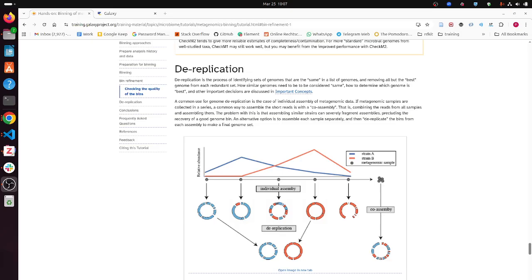One downstream process that is done often from now would be dereplication, meaning you might be able to find a lot of bins in your different samples, but they all might be on the species level belong to the same species. And what is done to consolidate data of complete studies usually is to dereplicate, for example, on species level with a similarity of 95%, and then report the best MAGs found for your study.